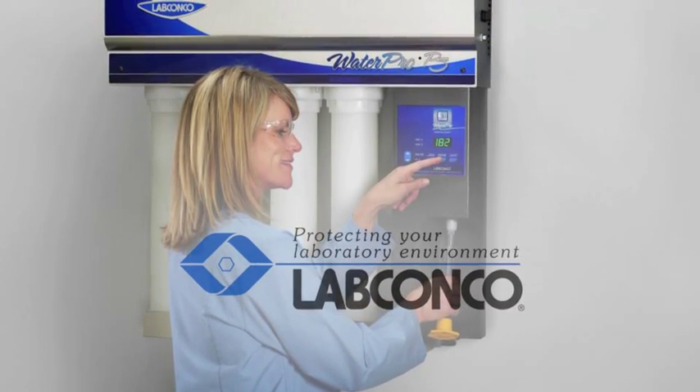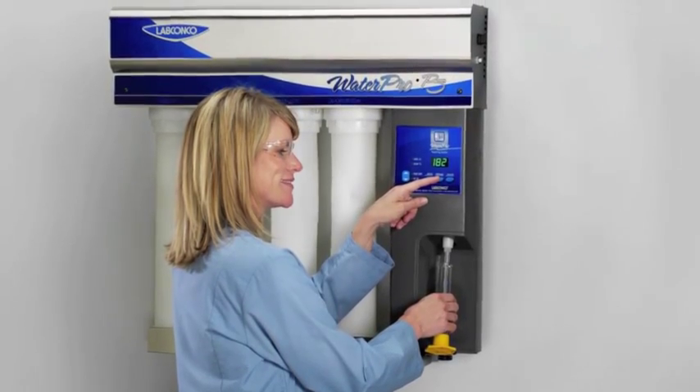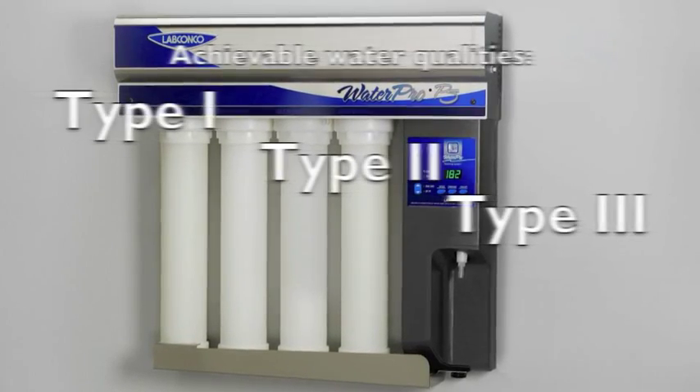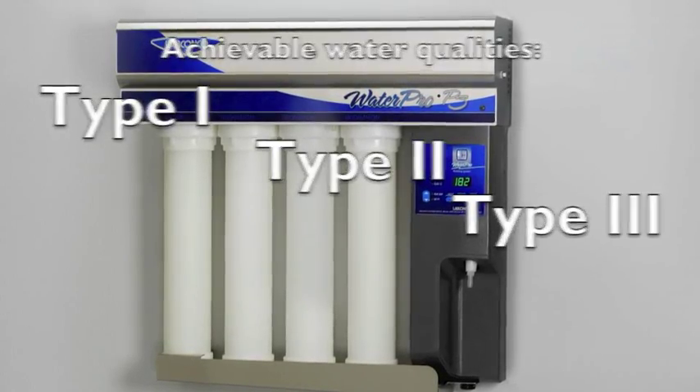LabConco WaterPro PS polishing systems produce Type 1 Ultra-Pure water, also known as 18.2 megaohm water, for a variety of laboratory applications. When water set points are properly entered, Type 2 and Type 3 water qualities can also be achieved.